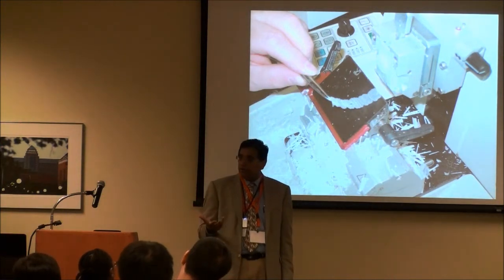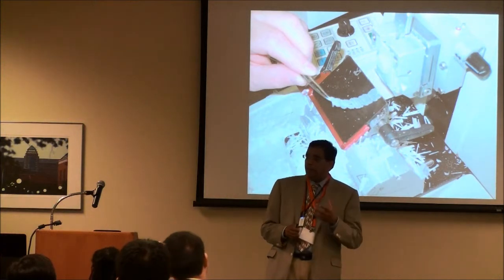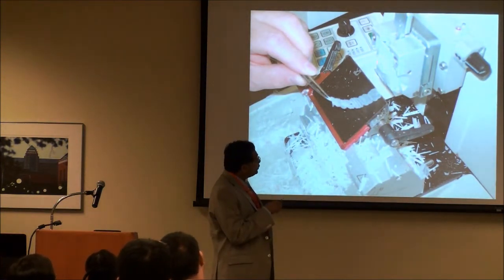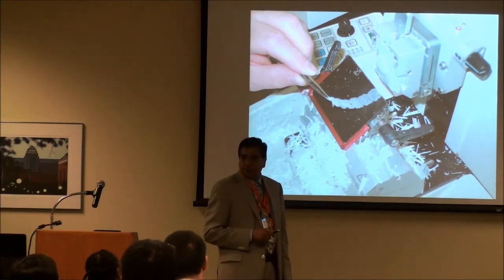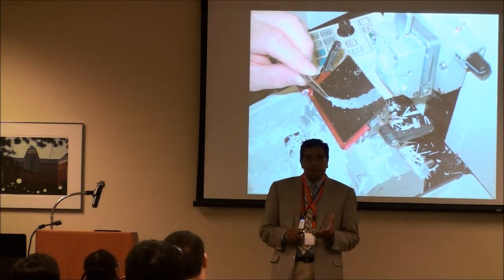It's called archived. Generally, according to American regulations, we are supposed to keep the block for 7 years. The slide, we are supposed to keep for 10 years.